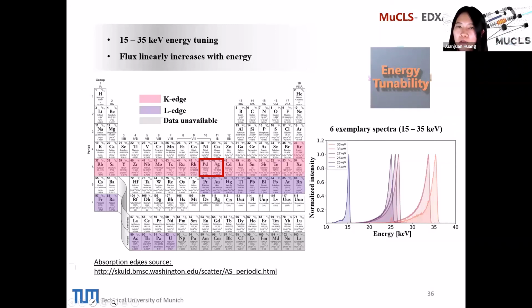Currently, also during this lockdown, the beamline is not very often used for X-ray absorption spectroscopy after all the proof-of-principle results that have been done. We don't really have a proposal system, and so far it's mainly our own PhD students and our own people doing experiments on it. So it's very flexible regarding beam time.